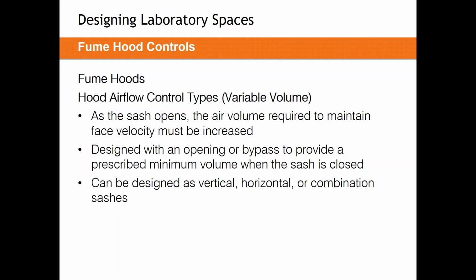Say we have 4 fume hoods that each open to 500 CFM. We would overdrive that lab and require 2,000 CFM of exhaust if they're all in use. In this case, our fume hoods would be inflating our makeup air number if they're constant volume. This is a really good application of variable volume fume hoods.